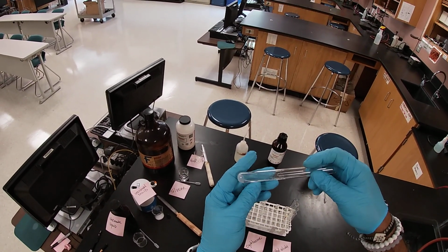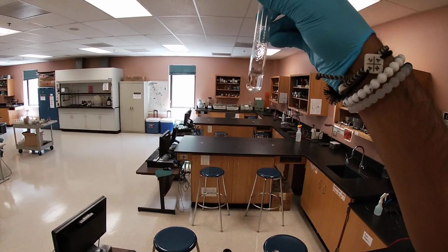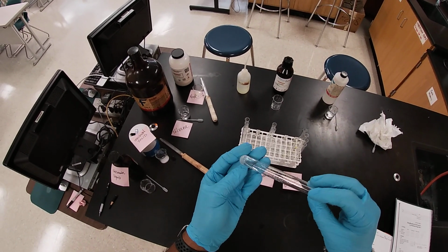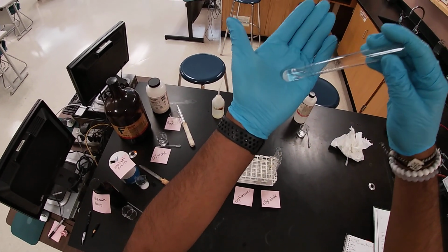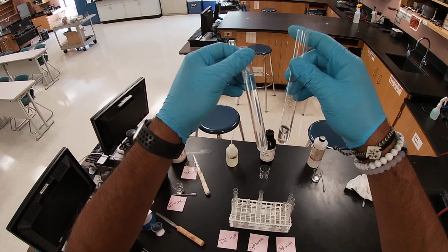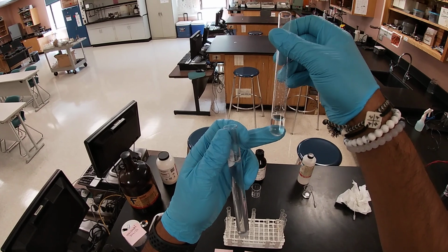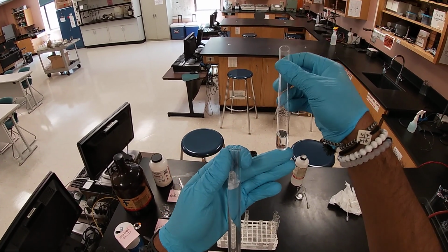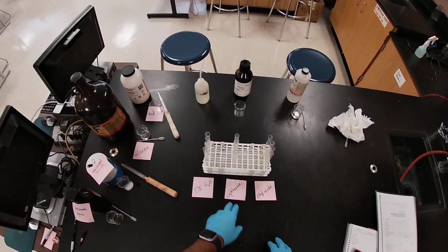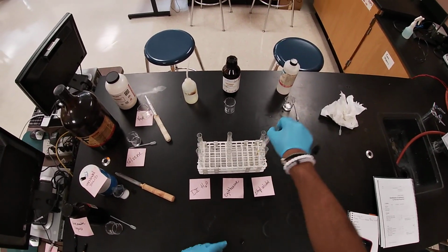And then here in cyclohexane, not at all whatsoever. Oh no, we still have some in there, but it doesn't want to. Seems like my solid is still at the base. It didn't have as much of an effect as it did for this one. If you notice the solutions, this one's cloudier with the water, and this one is still clear, and the base of it still remains a little bit of the solid. So we would say cyclohexane and the unknown solid would not dissolve.